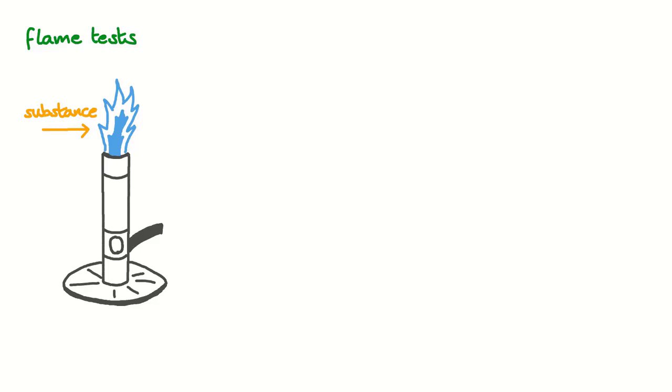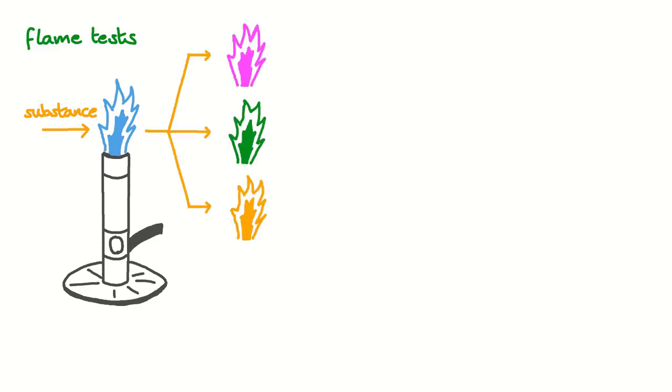A flame test is an experiment where a substance is put into a flame. Some substances give the flame colour. Understanding which substances produce which colours can help us identify unknown substances.